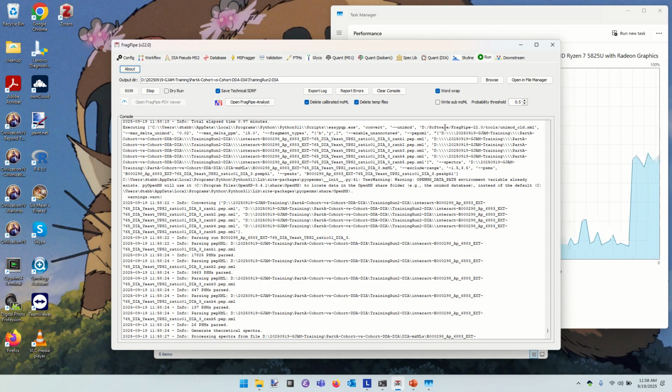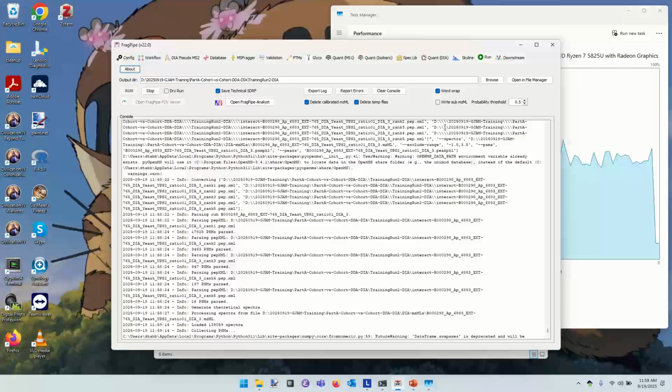Do you see the issue there? Like, if I have a protein peptide that I detect as part of my top 5 once, I still need the 12 data points in my chromatogram to quantify based on it, right? The quantification step is not where we are, though. No. We're just building the spectral library. Okay. So if it makes it into the spectral library at all, you will quantify later on. We'll attempt to quantify it. Yeah. This is just to say that in order to get identified in the first place, you've got to be at least in the top 5 of one. Okay. Then not a problem.